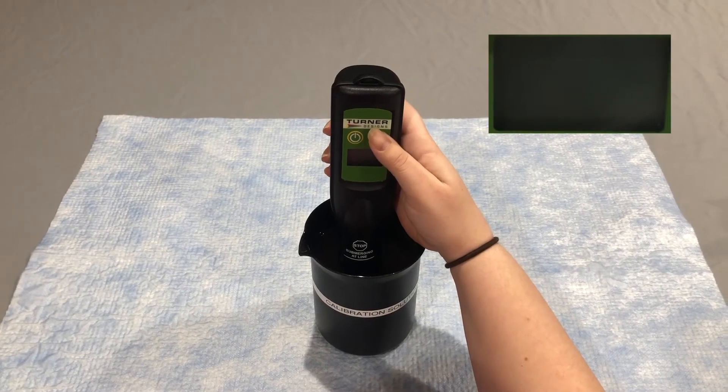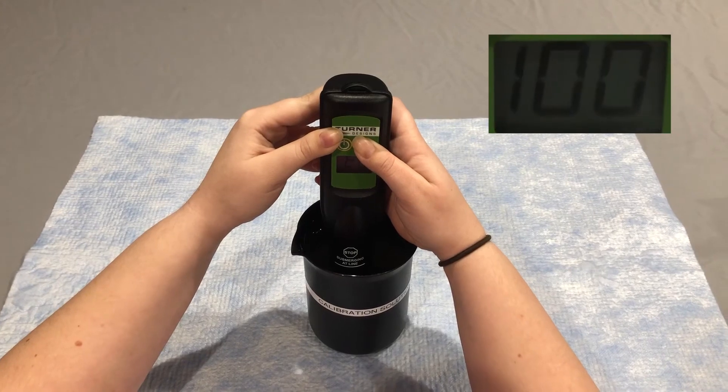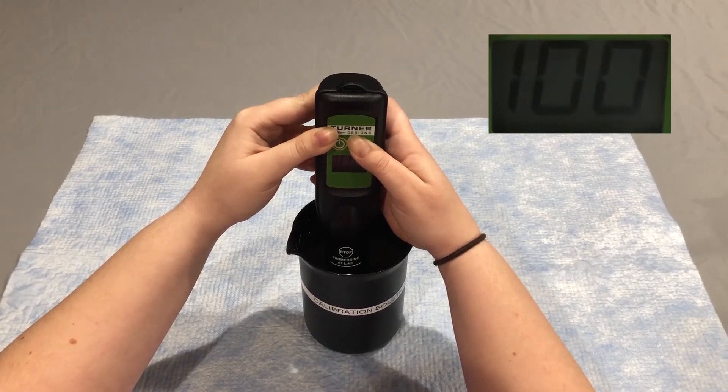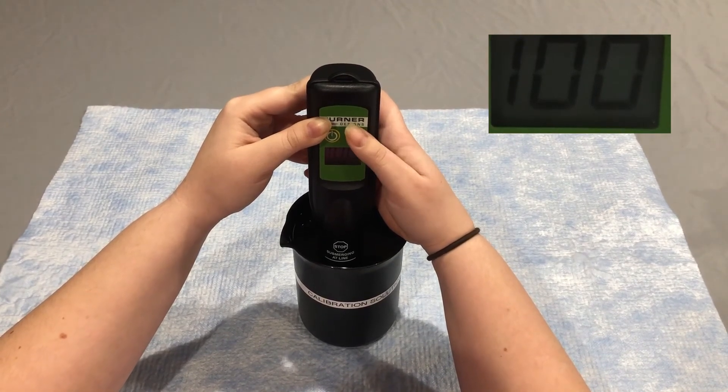While holding the read button down, press the on button. First TD will appear, followed by 100. When 100 is displayed on the screen, release the read button and then press read.